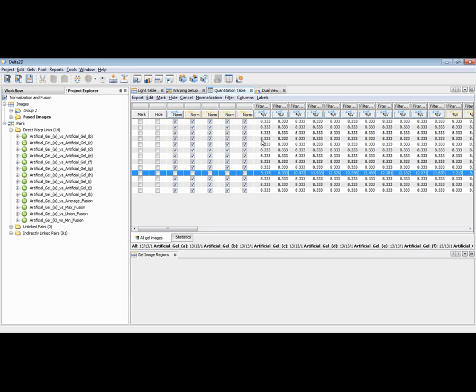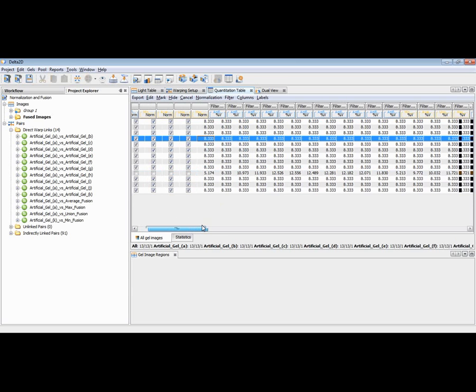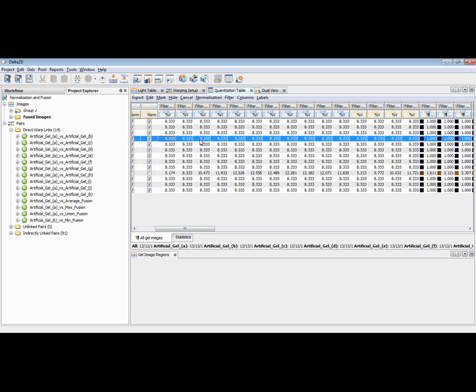And then you can see that the volumes of the other spots, which are still normalized but only against the spots that do not change too much, all these spots now have a real constant normalized volume. Only the strong spot is changing, and this is what we expect.